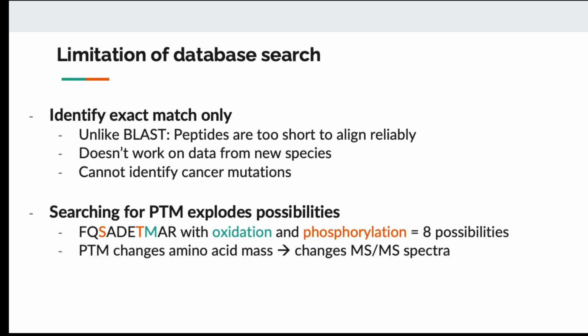And you might think that when we analyze DNA sequencing, we perform BLAST to map, and we know that BLAST allows for mismatch. Why can't we do the same thing for mass spectrometry? The problem is when you digest the protein into peptides, usually the length of the peptides is 5 to 20. So you only have 5 amino acids up to 20 amino acids.